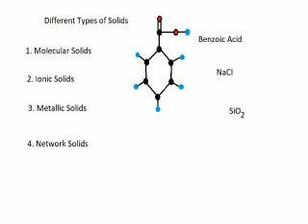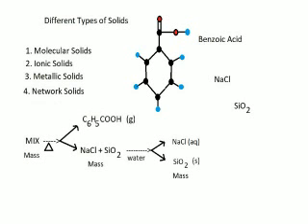Not going to be dealing with any metals today. They don't work with our process. So, we have a mixture of those three compounds, and I want to know what percent of the mixture is each of those compounds. And what you're going to do is simple. You're simply going to weigh out a sample into a petri dish to work with. Once you have your sample weighed out on the petri dish, we're then going to start separating the different solids.